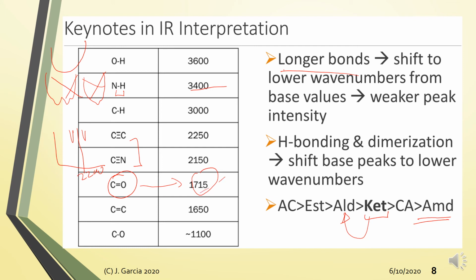Okay, so yeah, so you have carbon double bond carbon at around 1650 and carbon single bond oxygen around 1100. Okay, and if you notice, no, isang sikat na signal is yung for esters, no. For esters, the carbon oxygen bond will be found at around 1200. So why is that? Okay, for ethers, since you don't have a carbonyl bond, no, the bond length between the carbon and oxygen is a little bit longer.